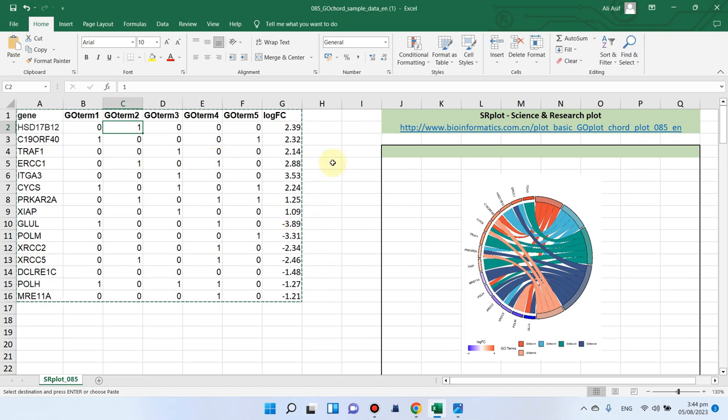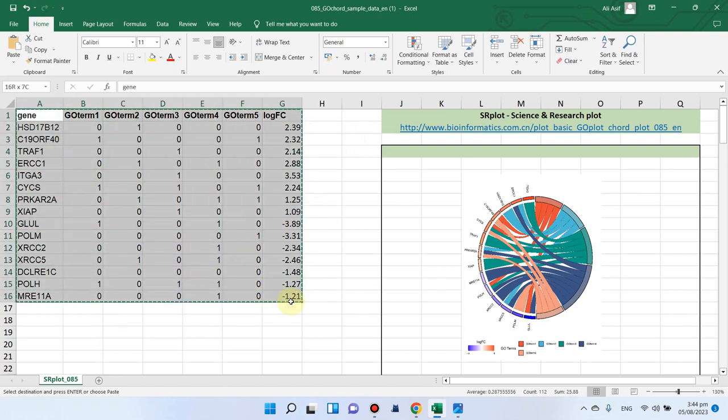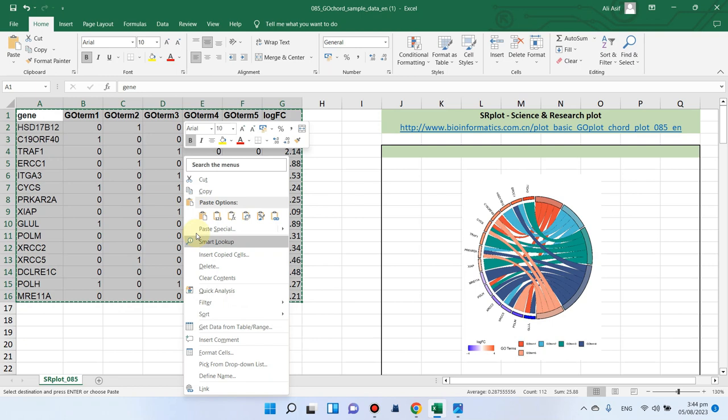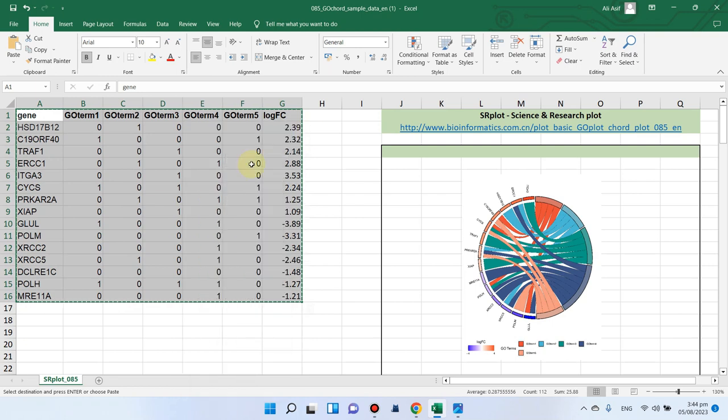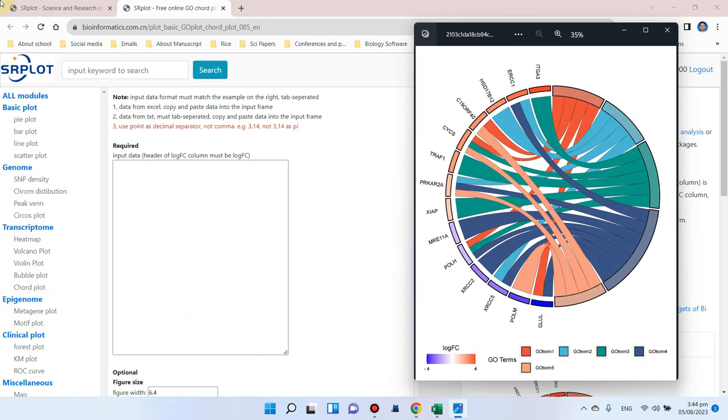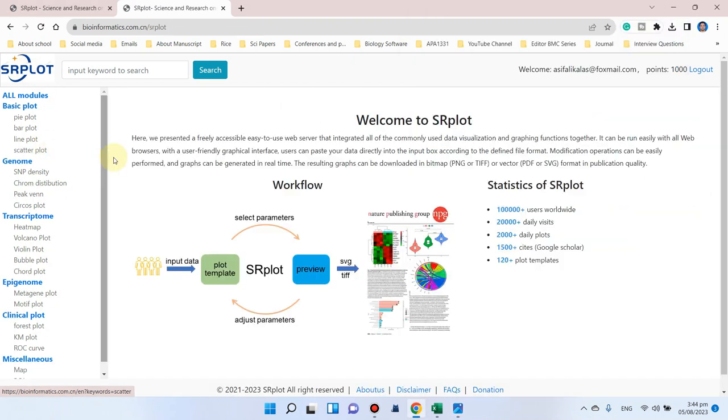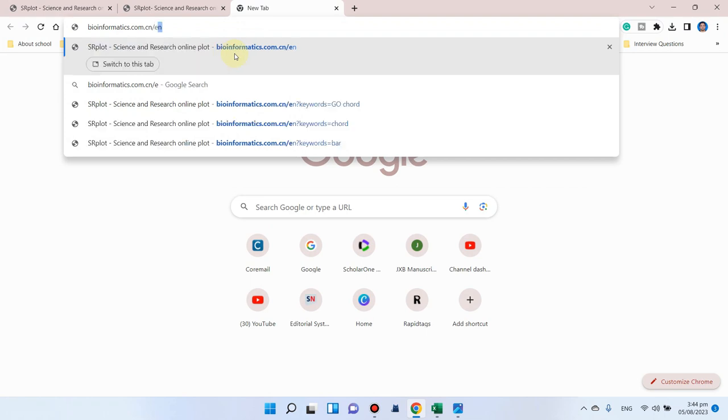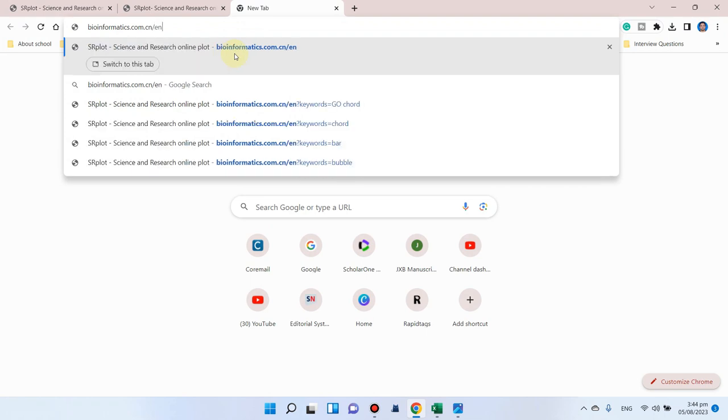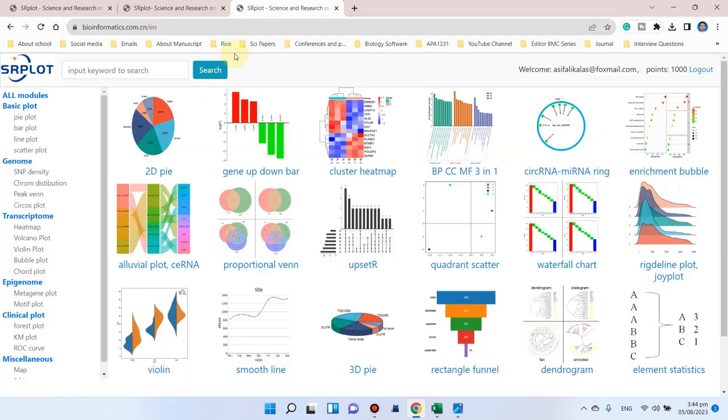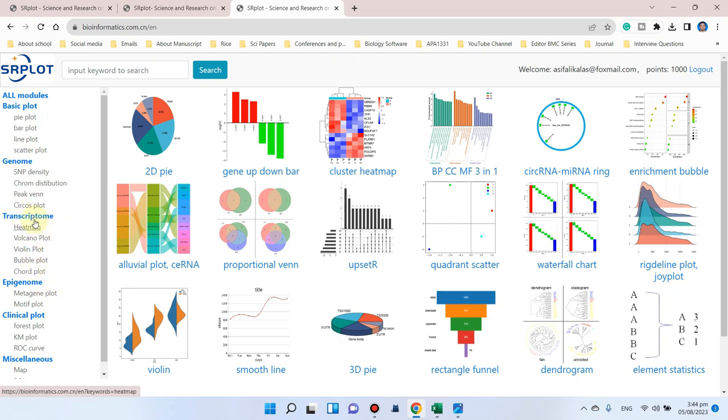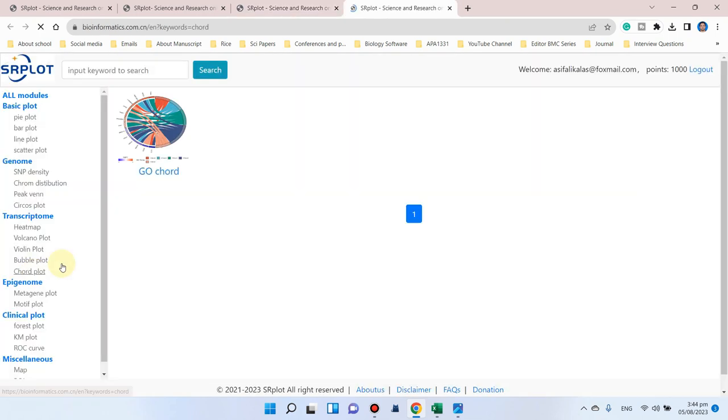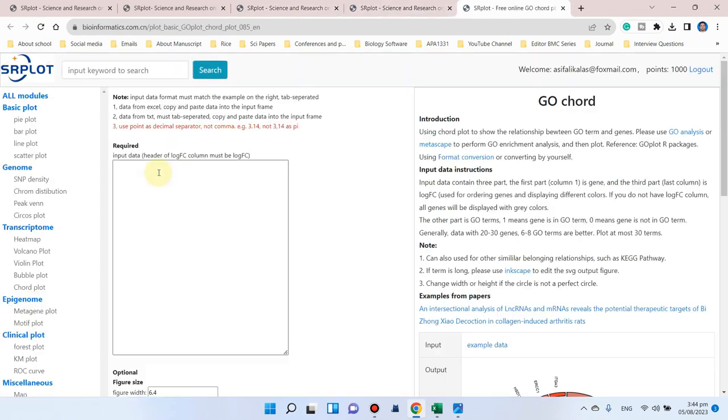You can simply copy this all data and go to SR plot website. When you go to this SR plot website, here you can see under the transcriptome, here is chord plot. You can simply click on this gene ontology chord.